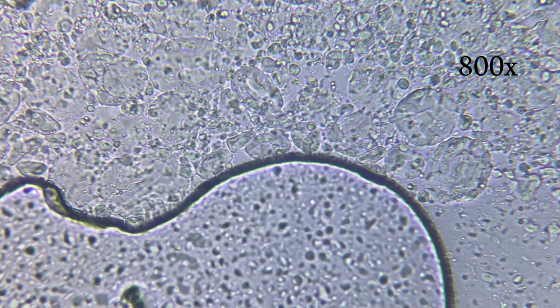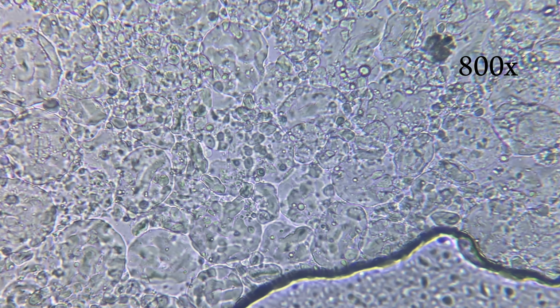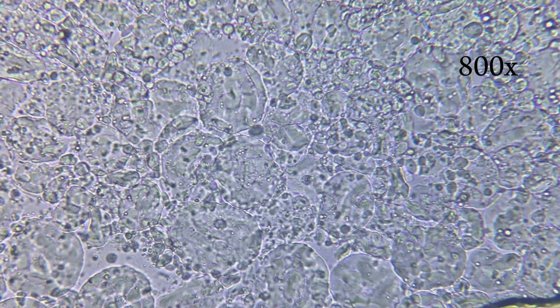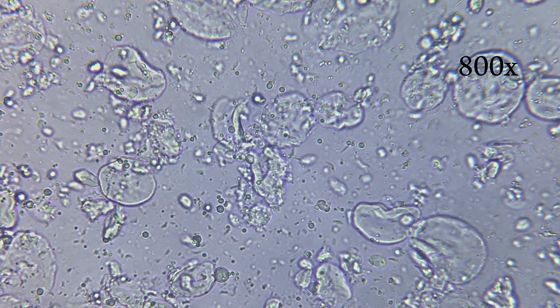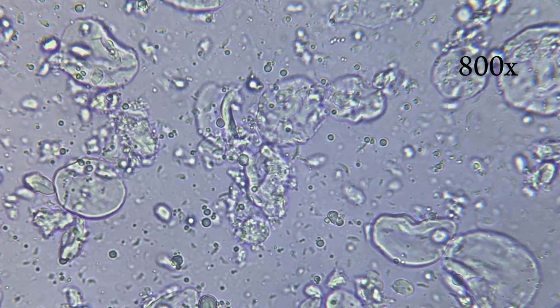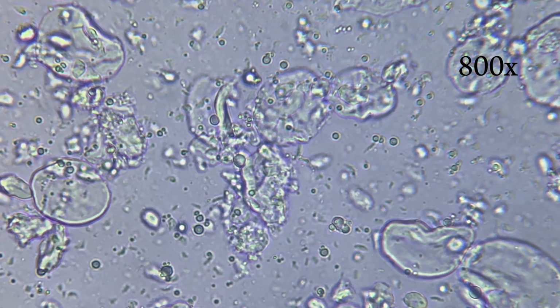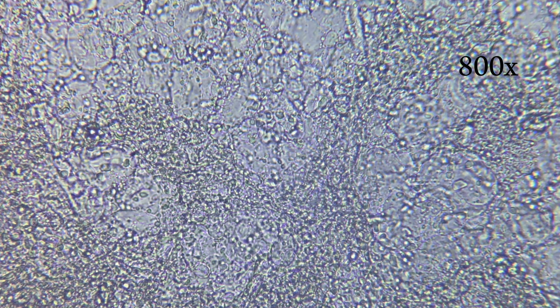At 800 times magnification, the bread's microstructure becomes highly detailed. The walls surrounding the air pockets are made up of countless tiny particles pressed together. The surface looks granular and textured rather than smooth. Small, rounded, and irregular formations appear throughout the material, adding complexity to the structure.